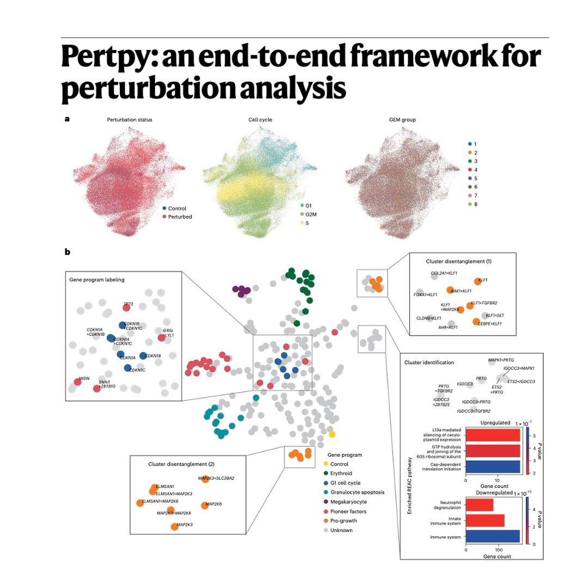And how does Mixscape computationally separate the successes from the failures? It's ingenious, really. For every single cell that was targeted, Mixscape finds its closest neighbors in the data that were control cells. It then compares the expression signature of your targeted cell to that local control neighborhood. If the targeted cell's signature is way different, it gets labeled KO, knockout. It worked. And if it looks just like its control neighbors, it's labeled NP, not perturbed. An escapee. It failed.